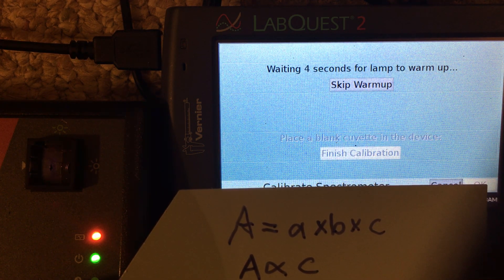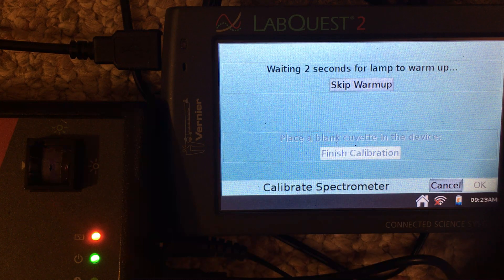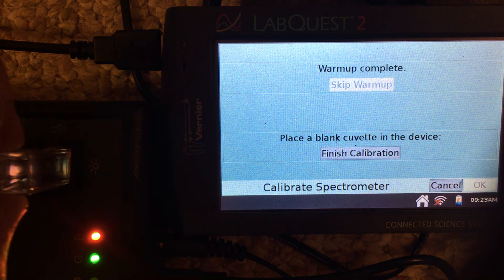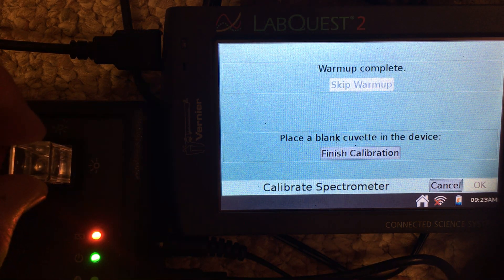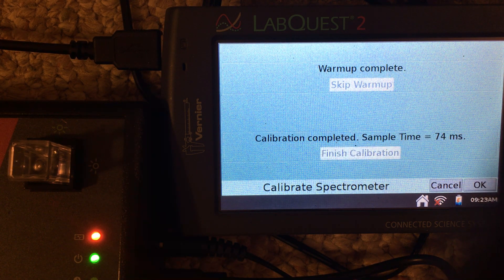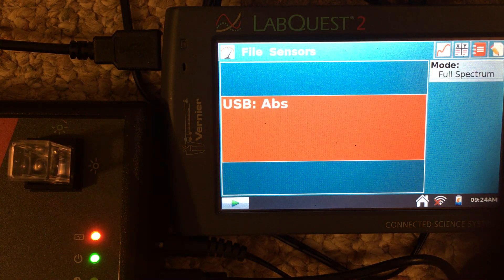It looks like we're about ready to move on. The warm-up is complete, and the next step is to place a blank cuvette into the spectrometer — a cuvette that just contains water. We tap finish calibration, the calibration is complete, tap OK, and we're back on our main meter screen.